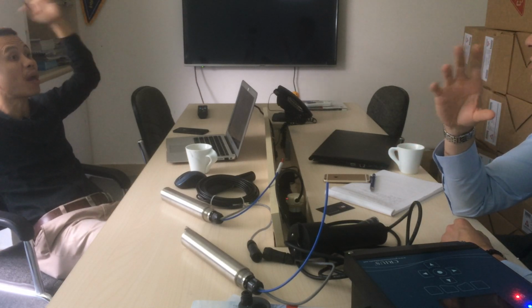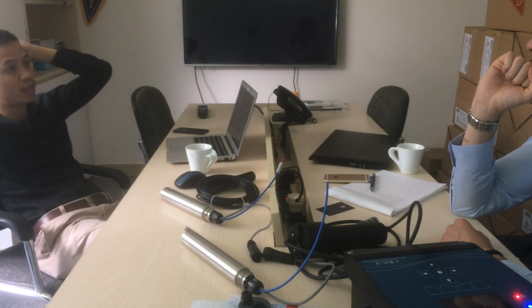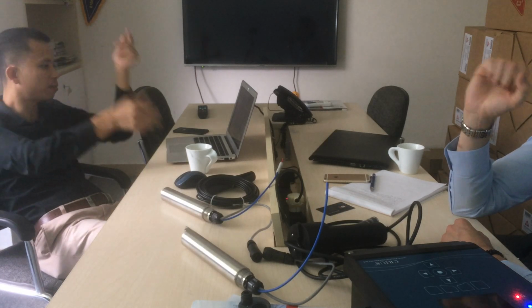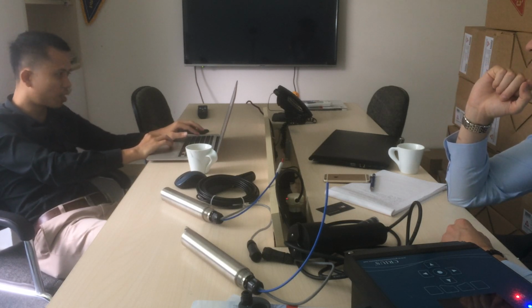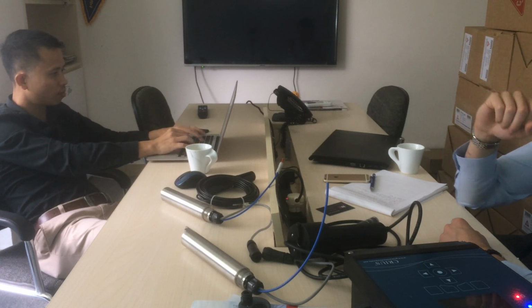Okay. But this depends on the size the equipment can detect. So you will provide a suitable model. Yeah. We have different size ranges, and the particle counter will tell you the size. Understand.